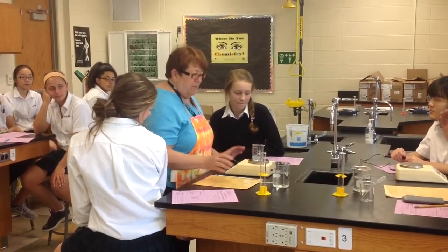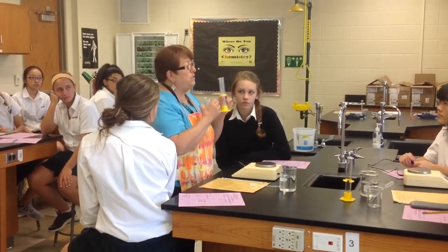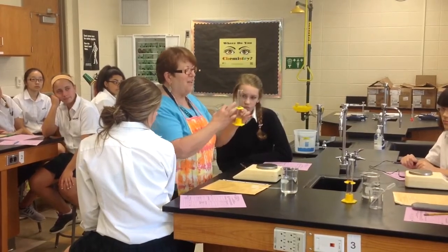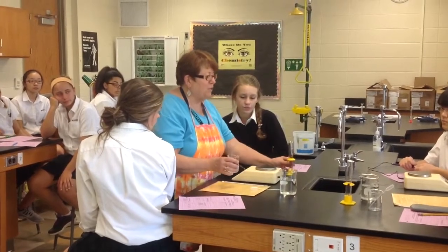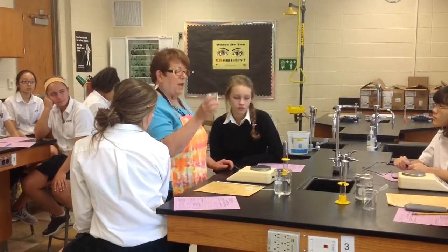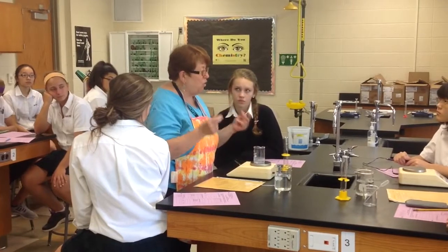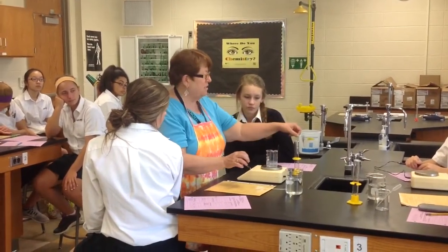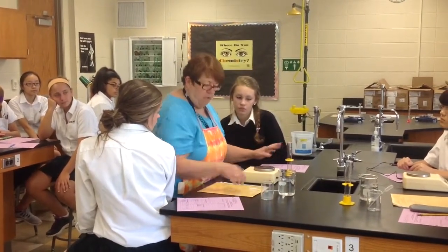And write it down. Then you're going to take that water, put it in the graduated cylinder to measure the volume. Follow the directions on how precisely you need to do that. Record the volume. Dump that water back in the beaker and dry the beaker. We'll give you some paper towel. Dry it out. Do it 2 more times. So you have 3 trials, but they should go quickly. Zero the beaker, 40 grams in the cylinder. Mass, volume, 3 times. The rest you do later.